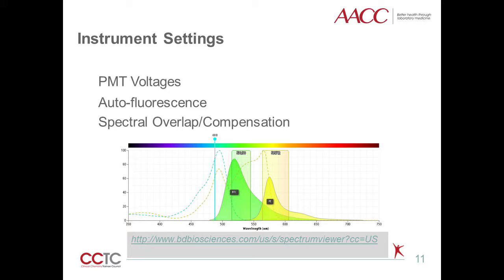The rectangles represent the wavelengths of light that can be measured by the optical filters on the cytometer selected for this example. The green and yellow solid peaks show the emission spectra of each label. Note that there is a large amount of the green peaks present in the 585/42 filter used to collect the PE signal, which needs to be calculated and adjusted for in the compensation.